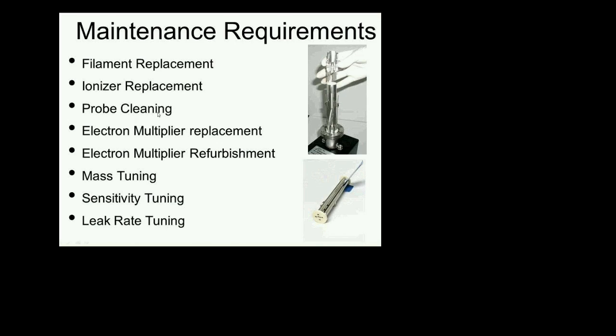In terms of probe cleaning, some manufacturers will allow you to take apart the device and clean the rods yourself. If you're inclined to do that sort of thing, and the manufacturer tells you it's possible, I would encourage you to do it. You'll learn a lot, you'll save yourself a lot of time and downtime, and it will teach you a little bit how the device works.